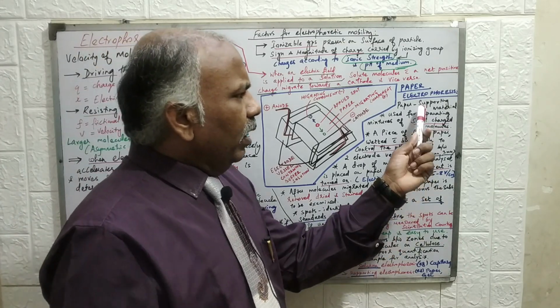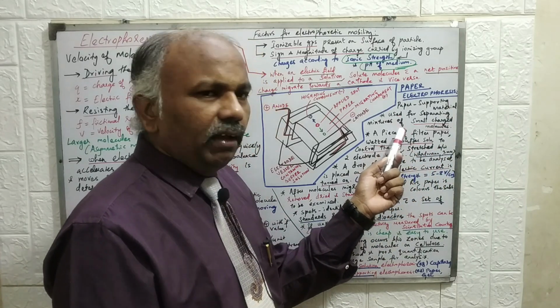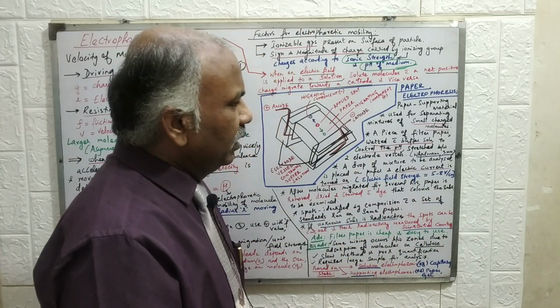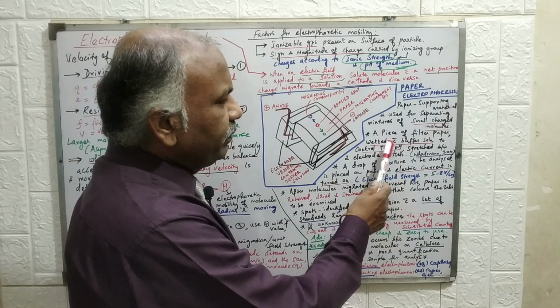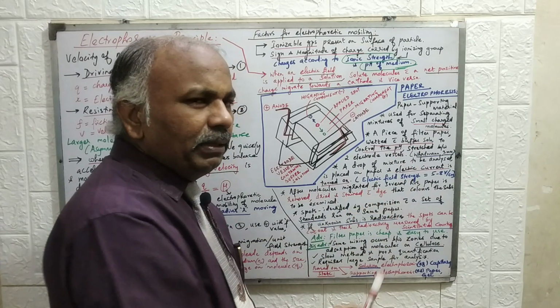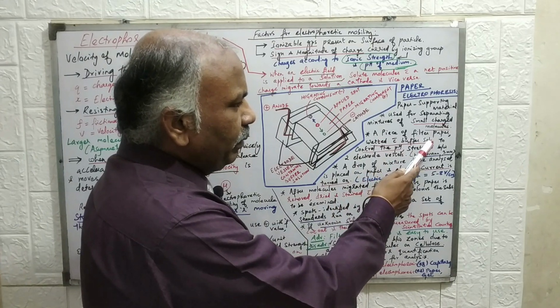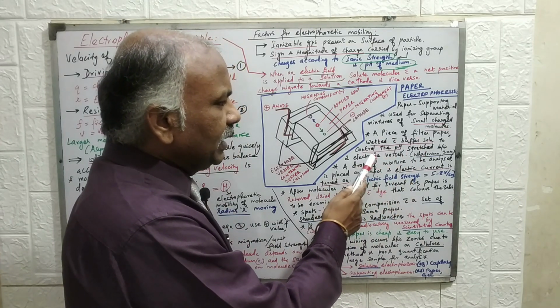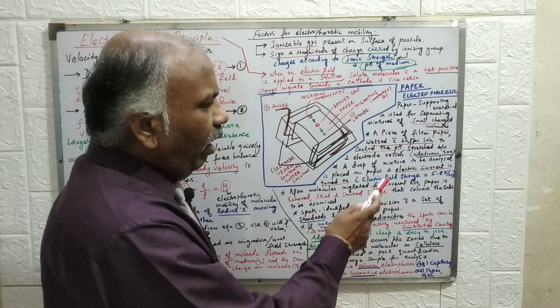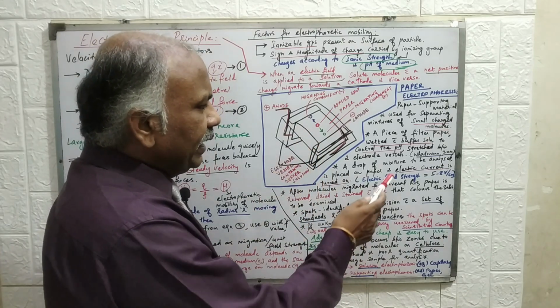Now, paper is the supporting material used for separating mixtures of charged molecules. Particularly small charged molecules can be separated by paper electrophoresis. Here a piece of filter paper is wetted with buffer solution, which is a very important mobile phase. We use Whatman 3 mm filter paper, wetted with buffer solution to control the pH and stretched between two electrode vessels. A drop of the mixture to be analyzed is placed at the center of the paper, and the electric current is turned on.